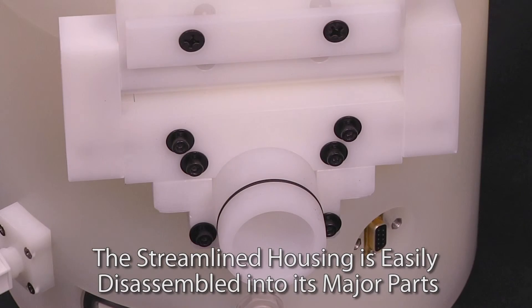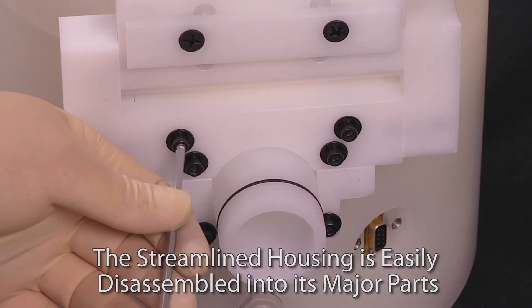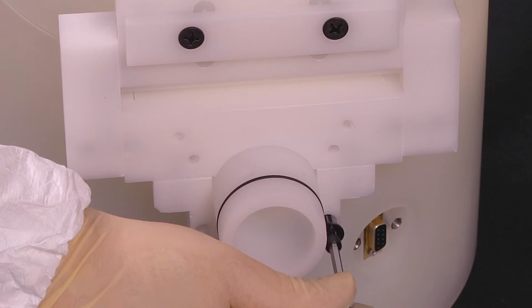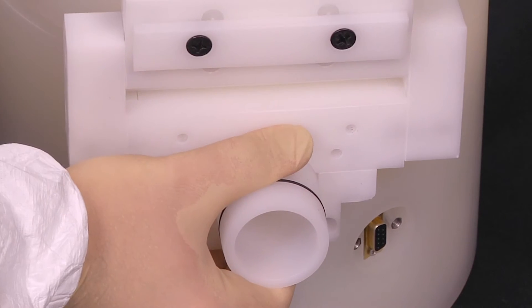With a streamlined housing that can be broken down into smaller sections, fitting a Laurel GBS series spin processor into your glove box couldn't be easier.